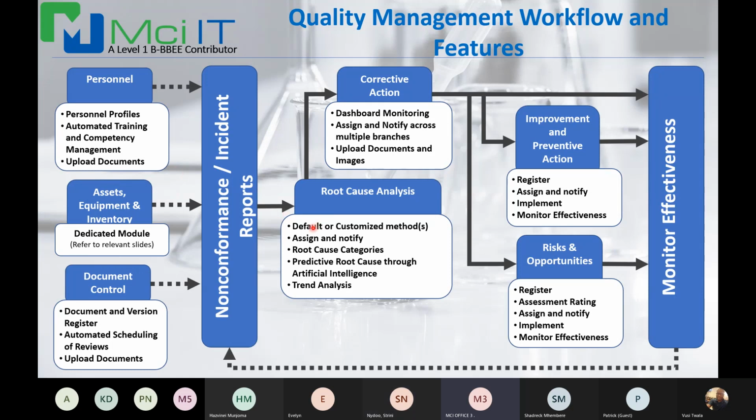Sorry, quick question. Under personnel, does that include, like, if a company has a requirement to do medical testing for their personnel on a regular basis? Does that module cater for that? Yes, so it's fairly robust in terms of the templates that you can set up, because they aren't just competencies. Let's say compliance. Compliance may mean competency in an SOP, or compliance may mean that personnel need to go for evaluations, whether that's a medical check or so forth, is irrelevant. I'll make sure to demonstrate that just now as well. So it's essentially anything that's recurring that people constantly need to be monitored on, and that has to be managed at the end of the day.